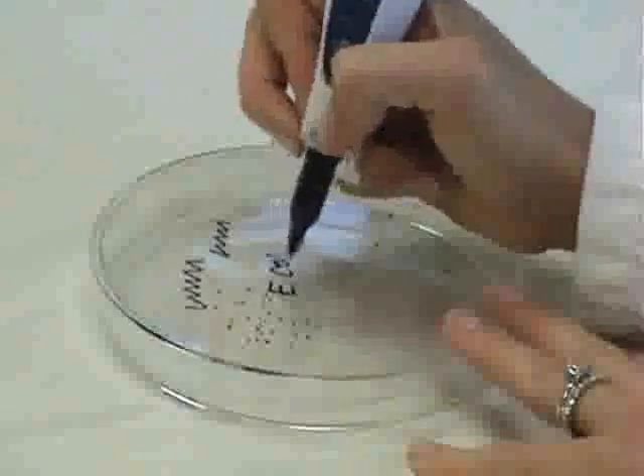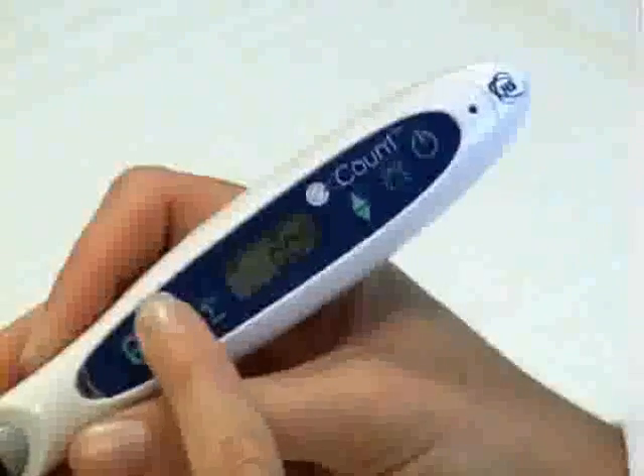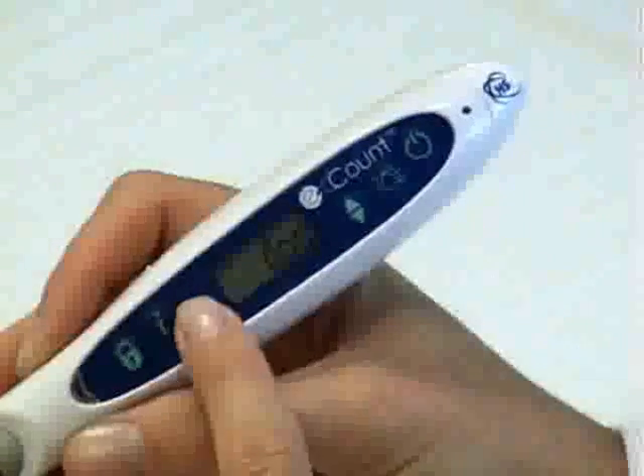The E-Count allows you to keep up to 32 separate counts in memory and toggle between them by pressing the I key. The sum key displays the sum of all counts in memory.